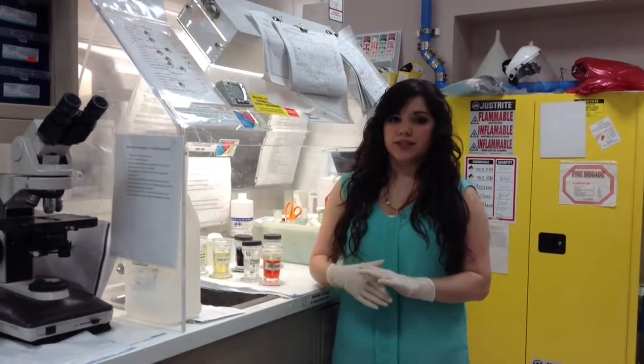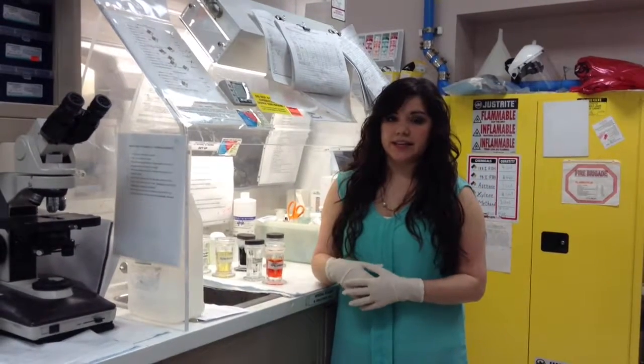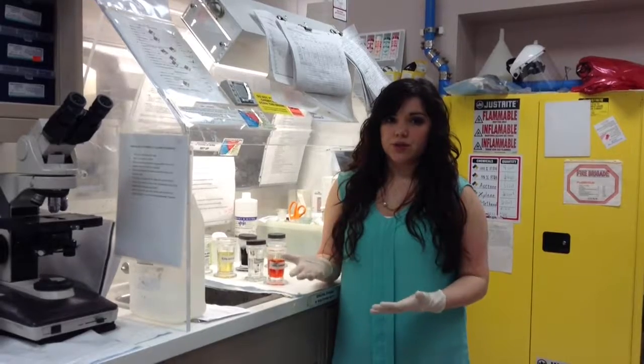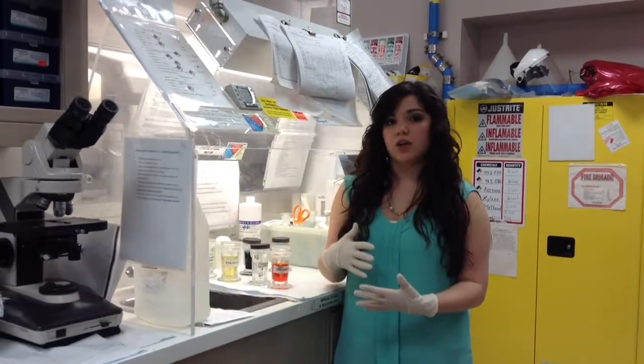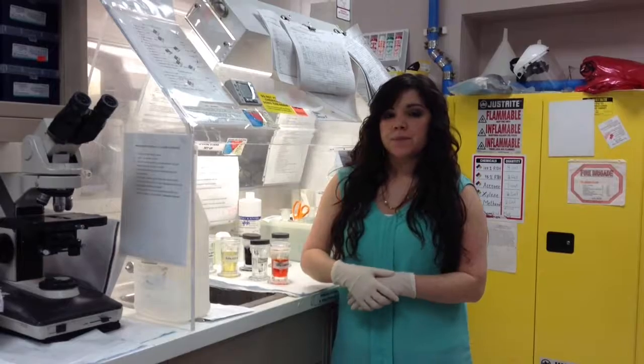For this day, you will want to emphasize how we process specimens that have been collected with saline. Saline solutions, as you know, do not mix well with the Ficoll Hypaque technique, so we need to teach the students an alternative version of eliminating red blood cells from our specimens.